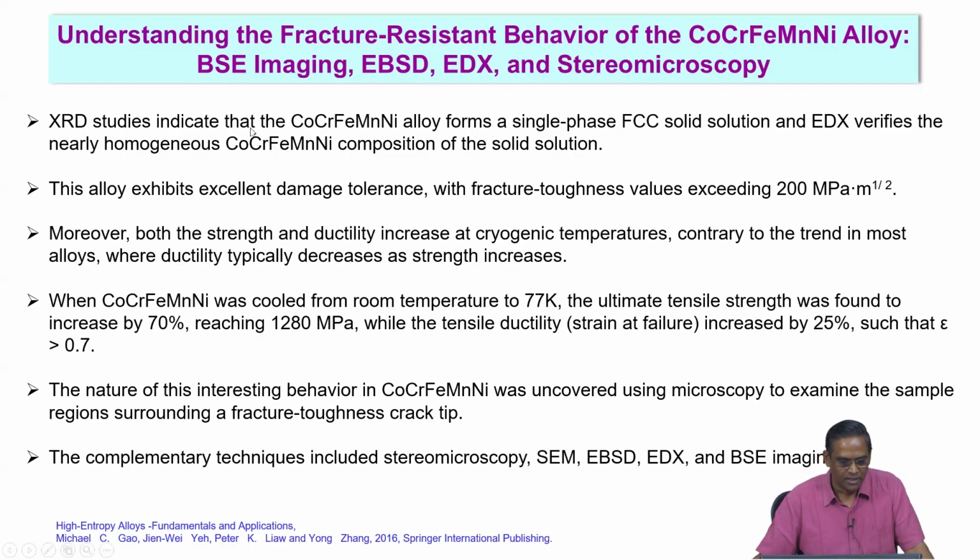The XRD studies indicate that this alloy forms a single phase FCC solid solution, and the EDX verifies the nearly homogeneous cobalt, chromium, iron, manganese, nickel composition in a solid solution. The interesting property is that this alloy exhibits excellent damage tolerance. What do you mean by that? What do you mean by excellent damage tolerance?